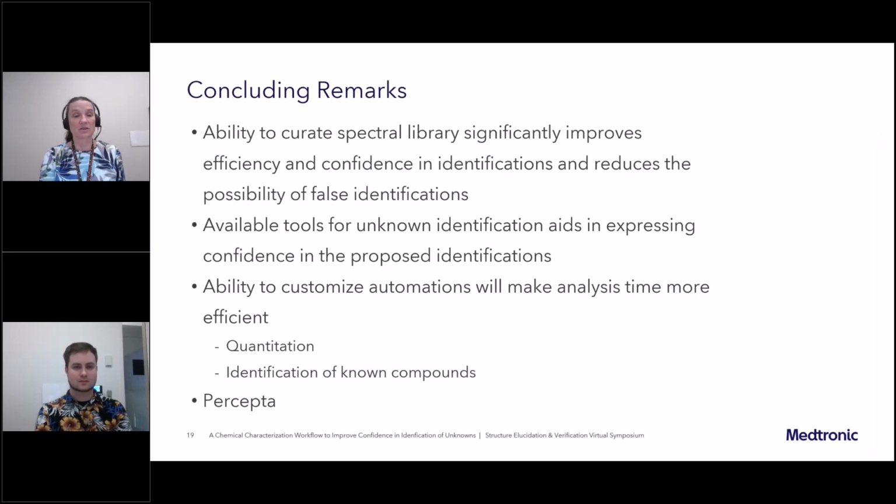So this is a custom script that we worked with ACDLabs on, where when we get done analyzing our data, it will perform that quantitation on our compounds. And so that's already been validated. It selects the correct external standard, and it uses the correct RRF for performing those quantitations.